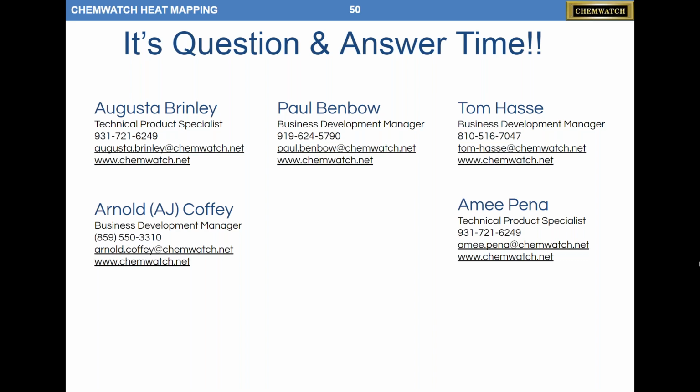We take that ingredient data, we contrast that with the amount you have, and then we're able to present that data. So we could, in fact, take this data and push it to ESRI, and they could create a GIS map. So if you're a GIS or an ESRI shop, we probably could export that data and allow you to do that. So in many ways, they're the same. We're just using Google Earth, and we're using AutoCAD floor plans or whatever floor plans you have to do the interior stuff. But as far as the external stuff, we could push that to ESRI. Shouldn't be a problem.